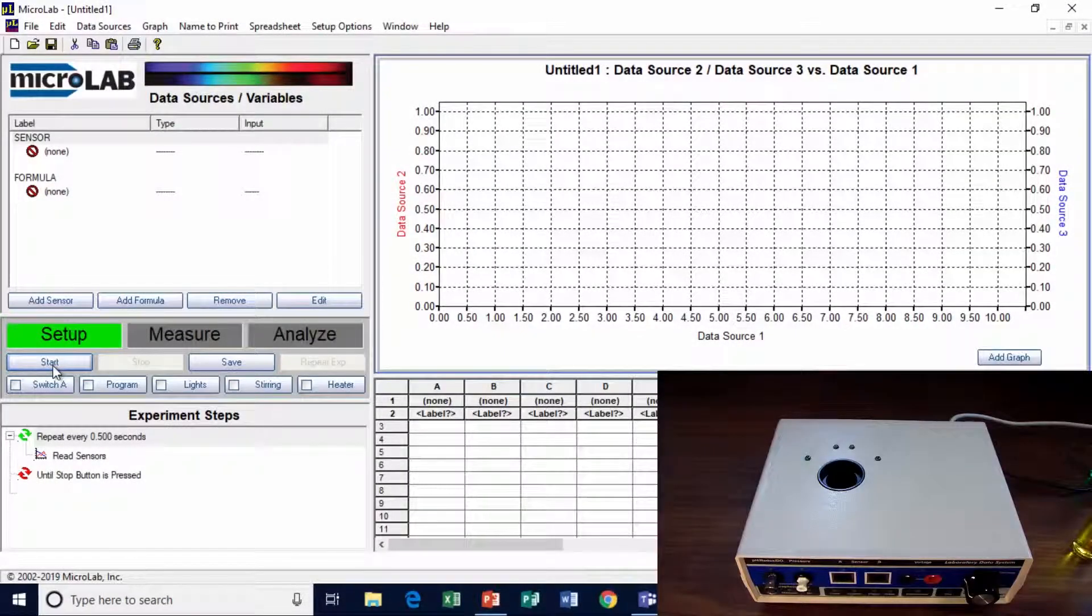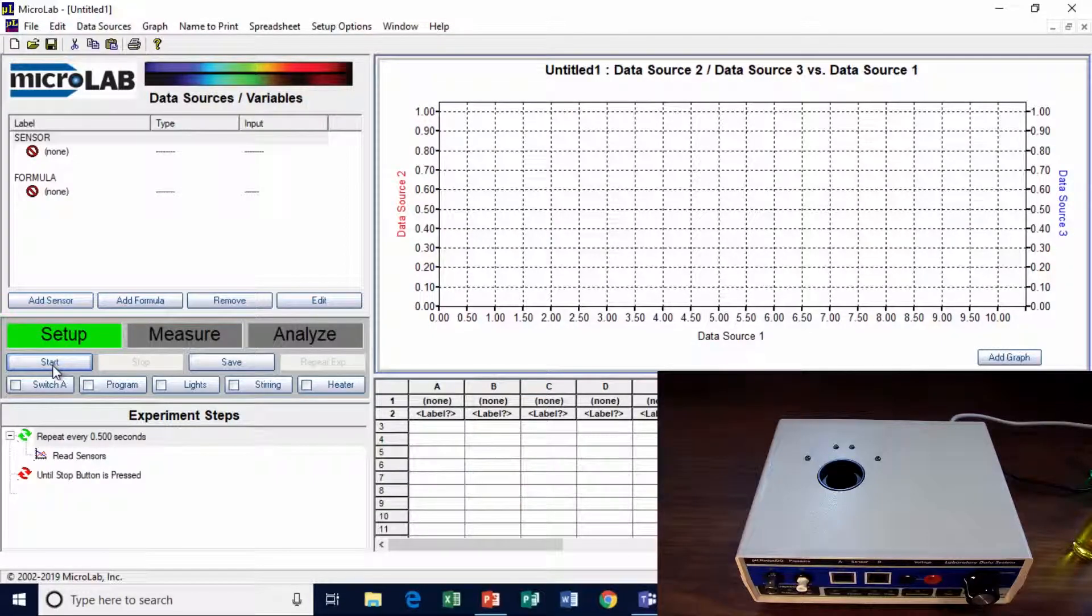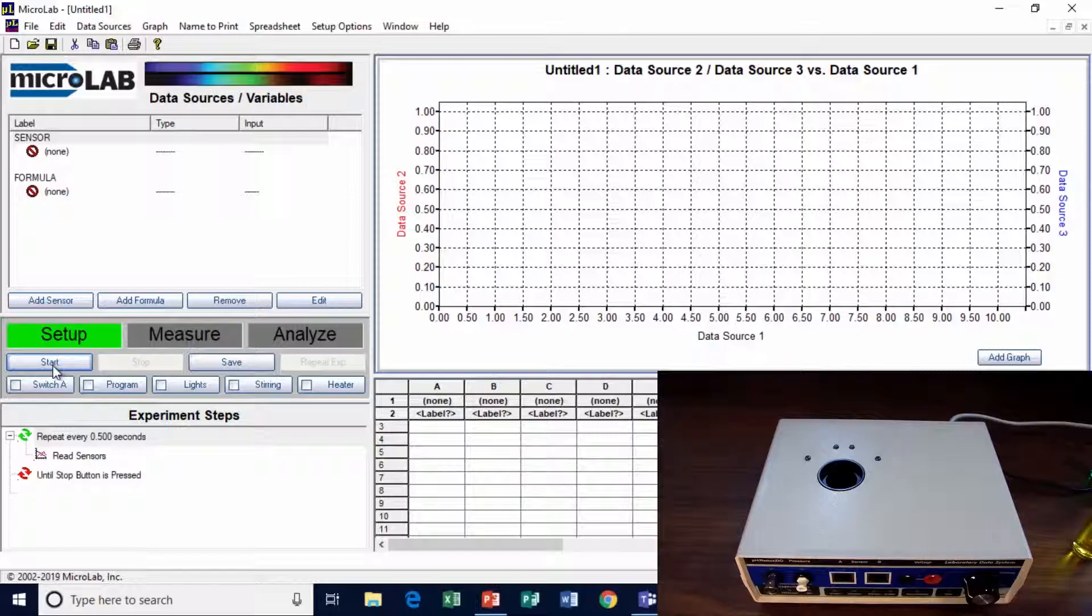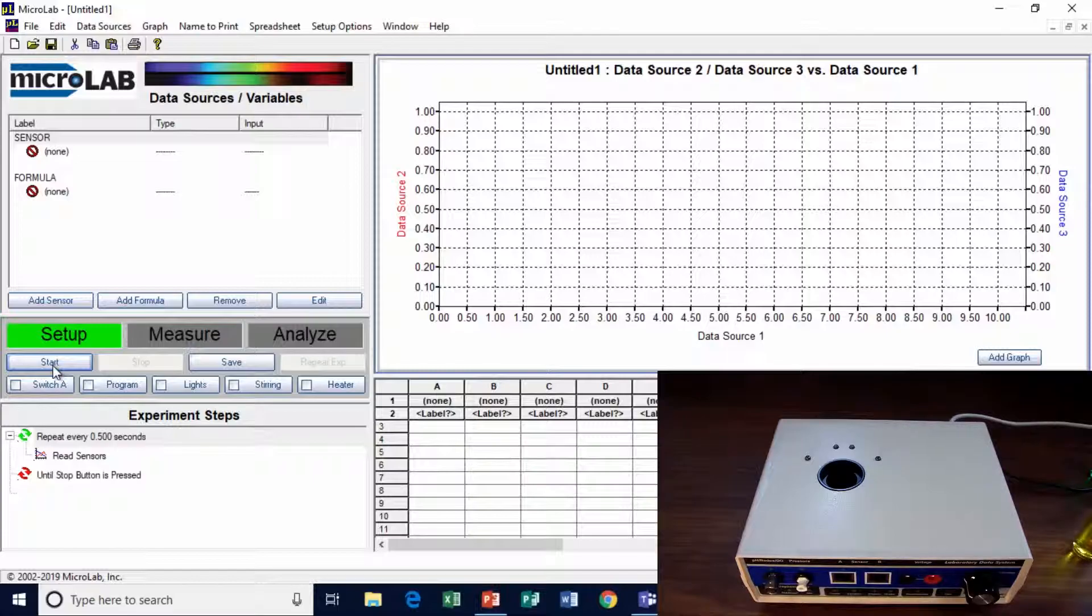Let's look first at sample illumination. Microlab has four LEDs in the top of its box. Two are white. They provide backlight for the sample, so you can watch its color change. The other two are green and are indicators for stirring time.